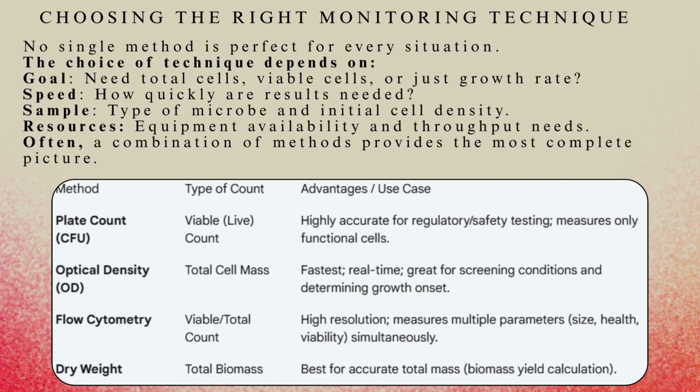The choice of technique depends on your specific goal. Do you need total cells or viable cells? How quickly do you need the results? What kind of microbe are you working with? Often the most complete picture comes from using a combination of methods.